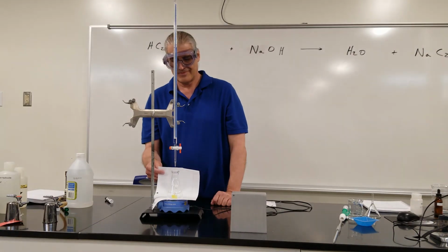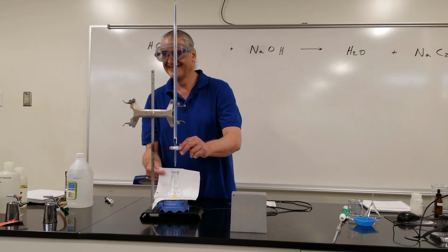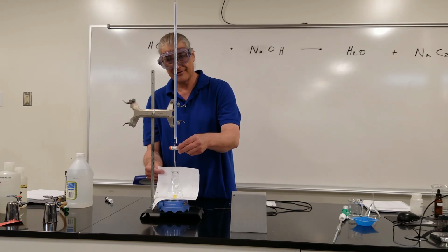It should turn pink. It should turn pink. What did you fill this burette with? We're getting there. We're getting up on the end point. There we go. You're starting to see a little bit of pink color. At that point, you slow down.